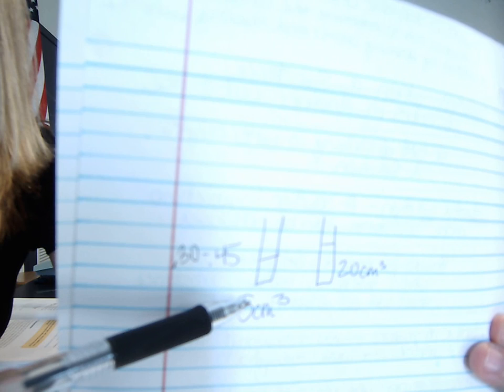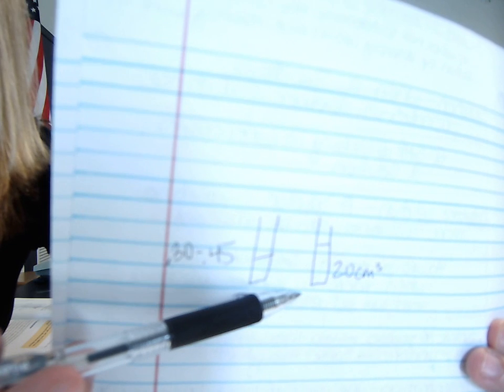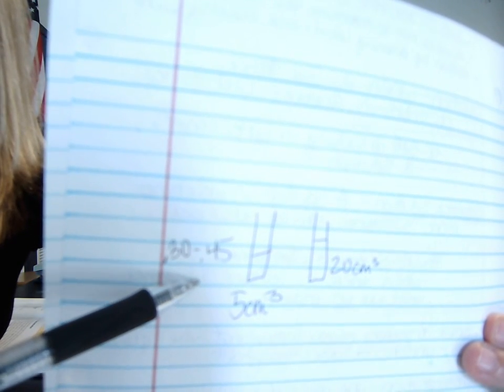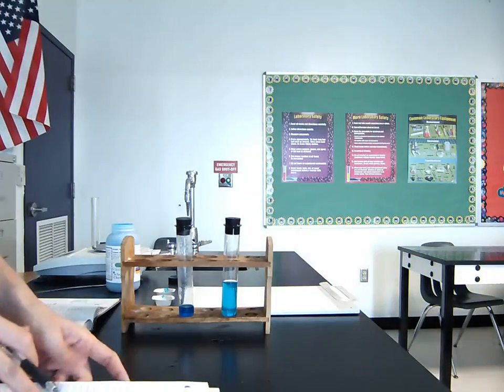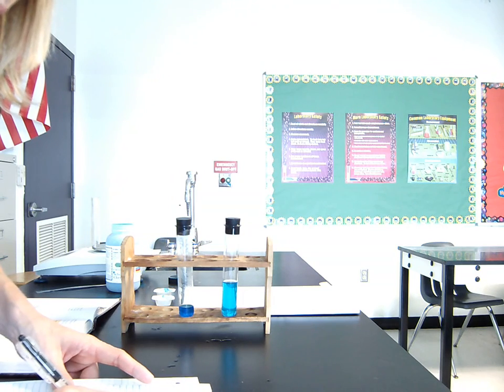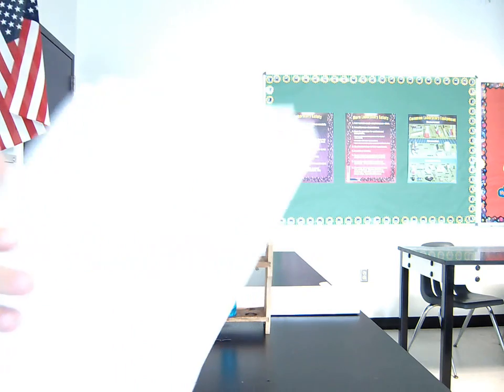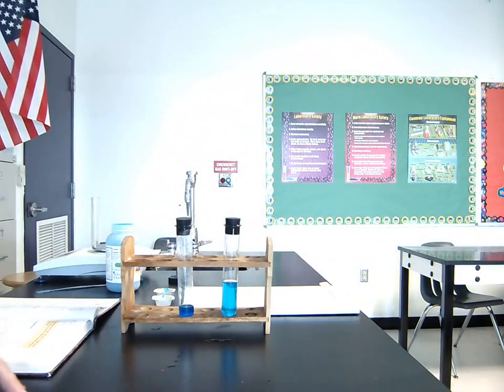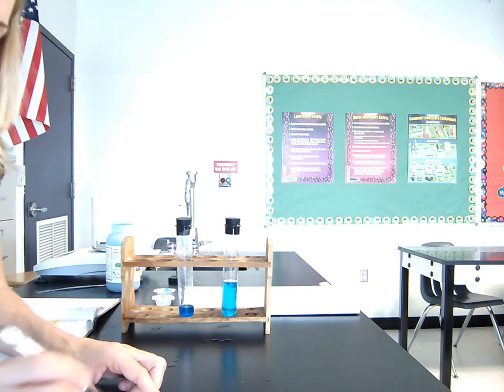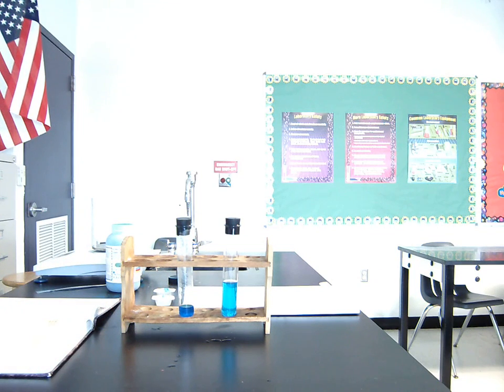Now, this is a 5 cubic centimeter solution. The 20 cubic centimeter solution is 4 times the amount of liquid. So logically, it would take 4 times the amount of solid to get to the saturation point, the point where no more will dissolve. So if we do our math, it would be somewhere between 1.2 grams and 1.8 grams. So mathematically, because that solution is 4 times more than the 5, it should take 4 times the amount of solid to get to the point where no more will dissolve. That's really hard to see, but you get the idea.